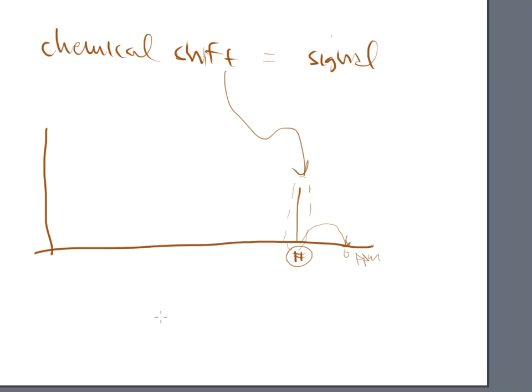Now, in the beginning with NMR, especially in a textbook, they're going to tell you the most common scale for chemical shifts is the delta scale. So the squiggly D, and they call it the delta scale. This delta scale is great. I mean, it's something that we can talk about. It's something that I can refer to, but no one in the actual industry uses the delta scale. Instead, they use parts per million. That's how we measure shifts.